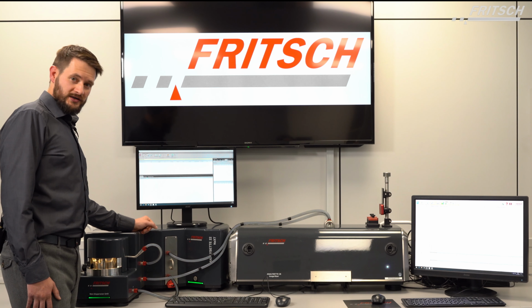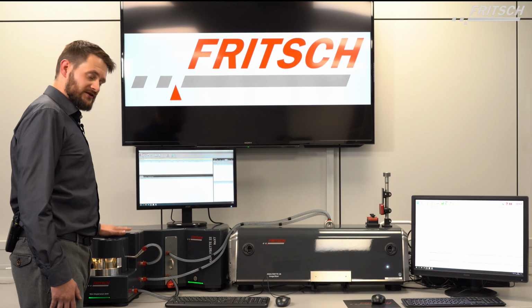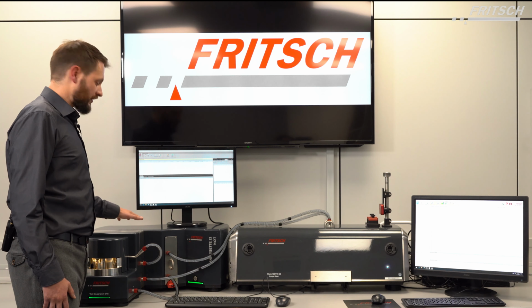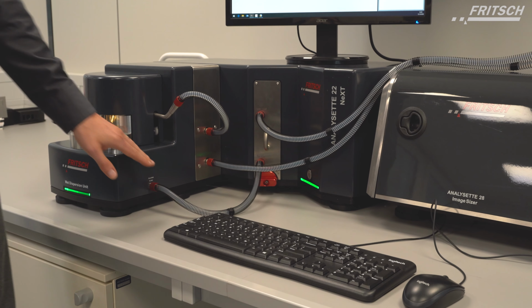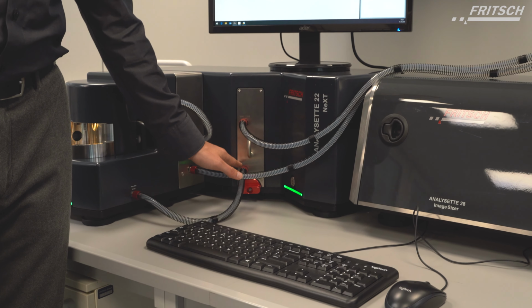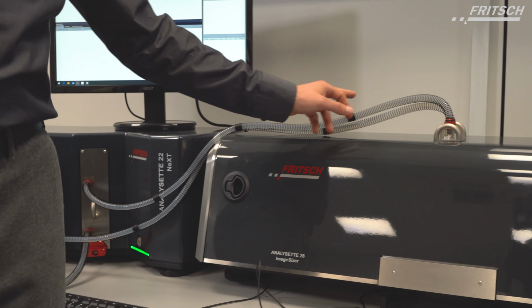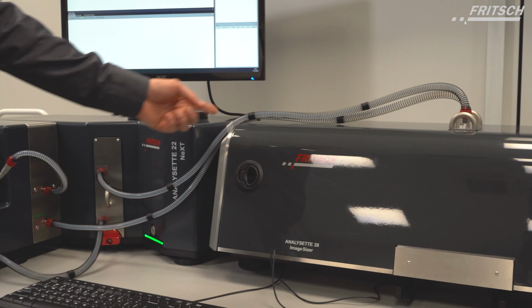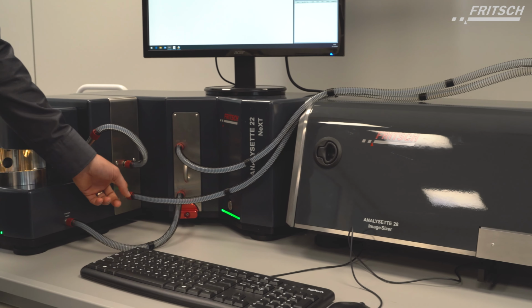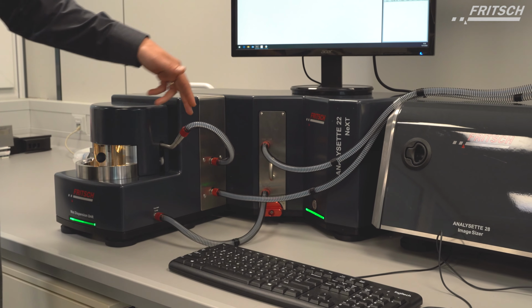In order to measure one sample at the same time with both instruments, we control our wet dispersing unit through the software of the A22. Our sample will then be pumped into the measuring cell of the A22, come out, take a detour through the measuring cell of the A28, go back into our ultrasonic box, which at this point is optional, and then get back into the dispersing unit.